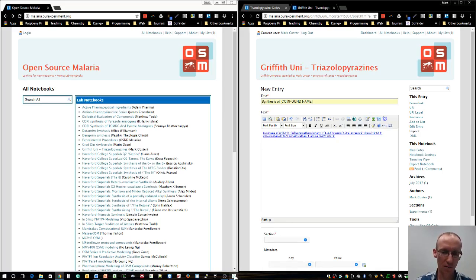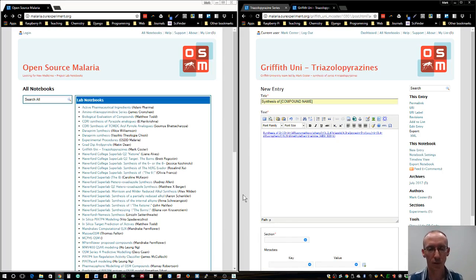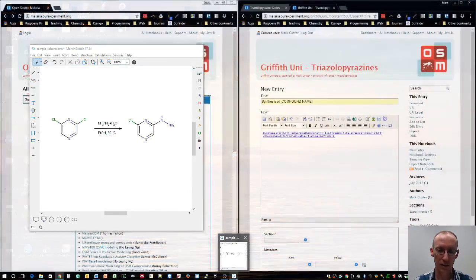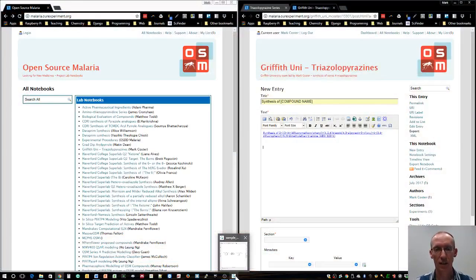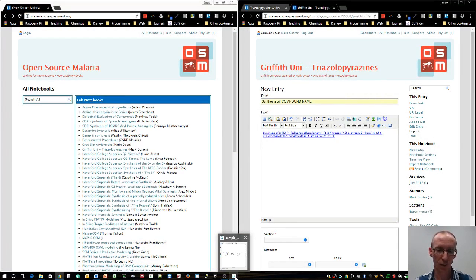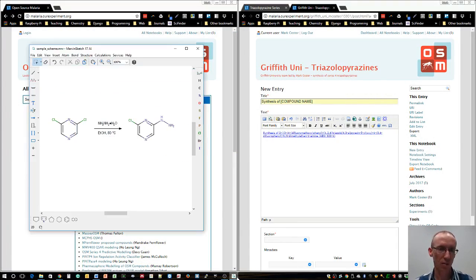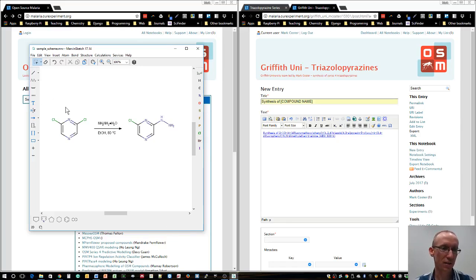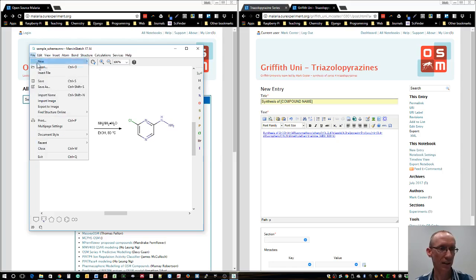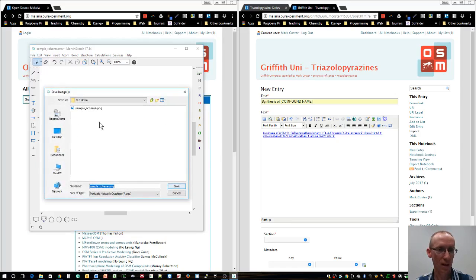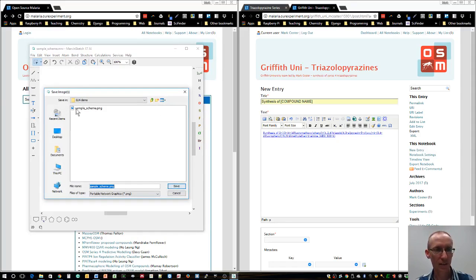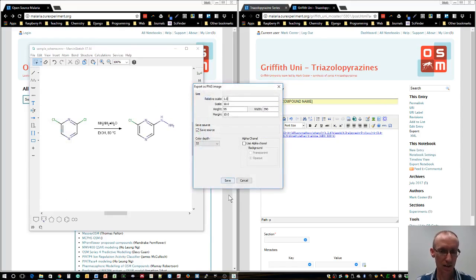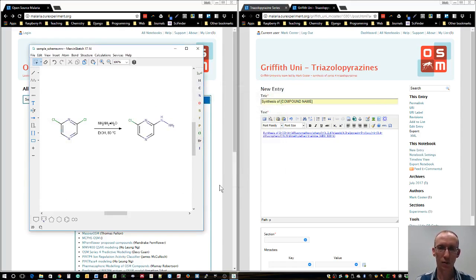I've recommended to my students to use freeware for drawing structures. One example where you can get a free license as an academic or student is the Marvin Sketch software. I've got Marvin Sketch open with a simple reaction that's at the start of many OSM procedures. Within Marvin, save that or export it as an image and make sure that image is a PNG file. I've already done this as sample scheme dot PNG, and we can save that.